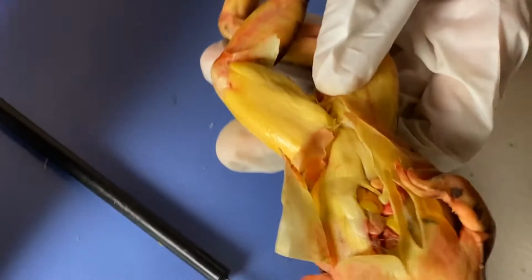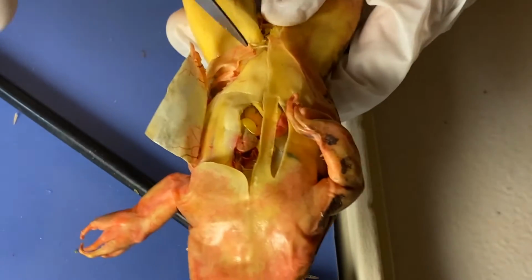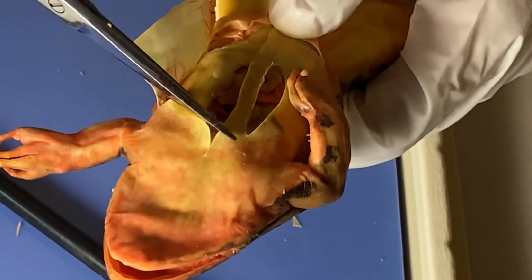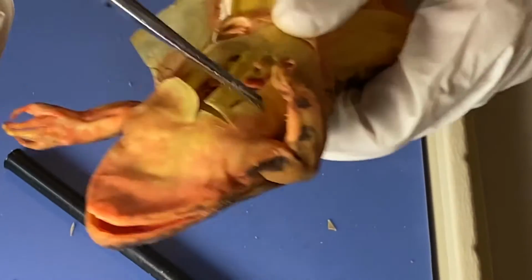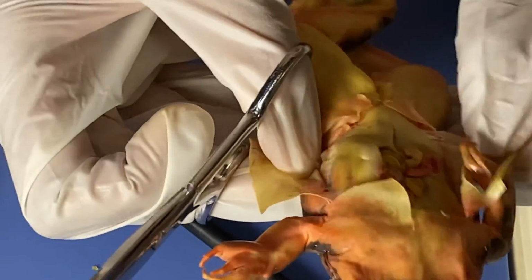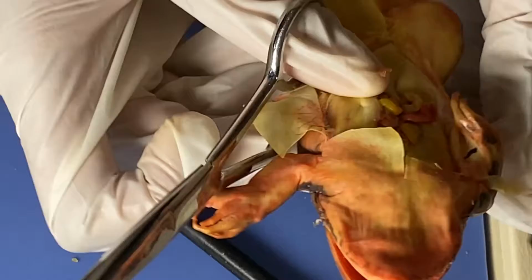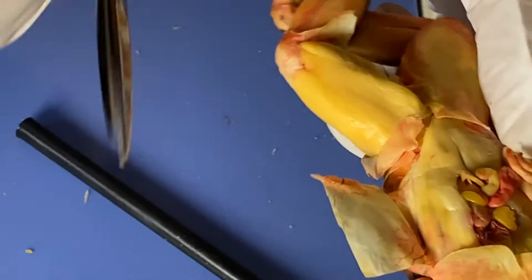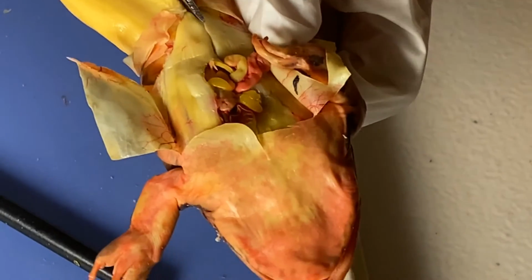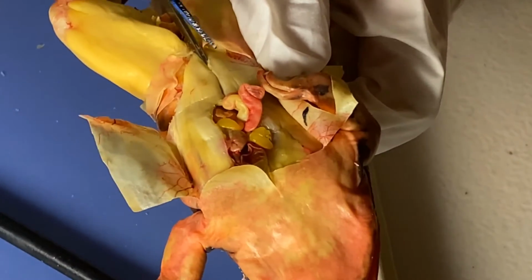Okay, so there is a muscle that I have to cut through in order to see the internal organs of the frog. This is the muscle I gotta cut through. And make sure that you're making shallow cuts just so that you don't damage any of the organs inside.